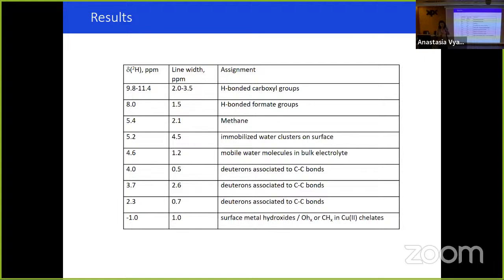The dental piece is like 2-3 centimeters, and the cavity is less than 1 cubic centimeter.